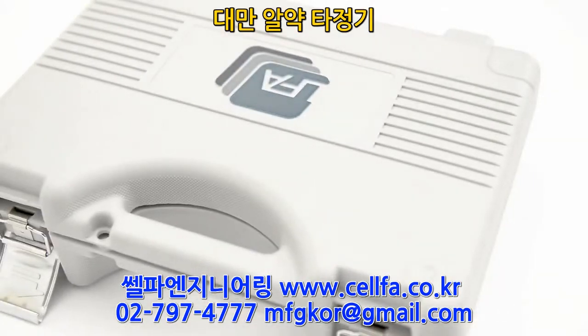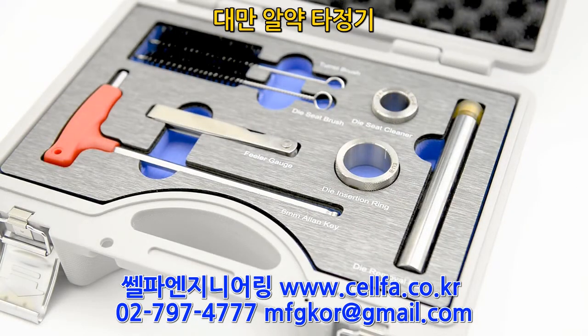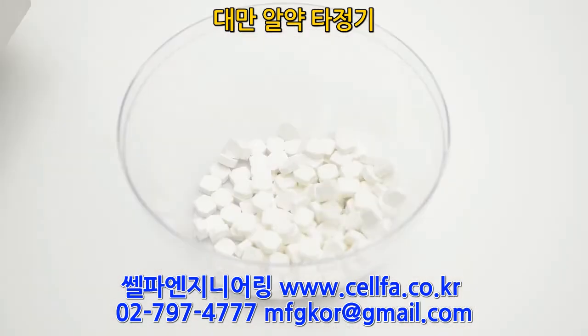Changing tooling has never been easier. With maintenance in mind, we've dramatically reduced the amount of tools needed to work on this machine, which we provide. This gives you more time away from maintaining your press and more time producing products.